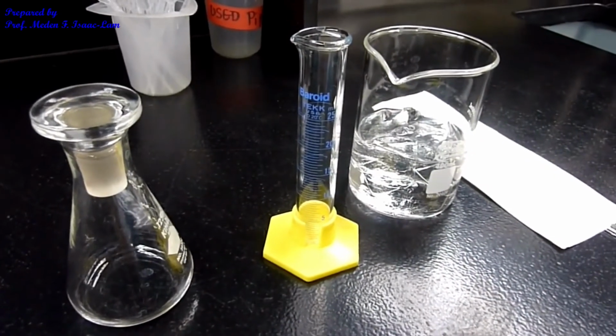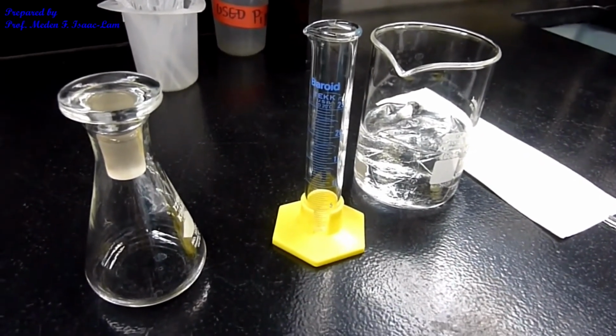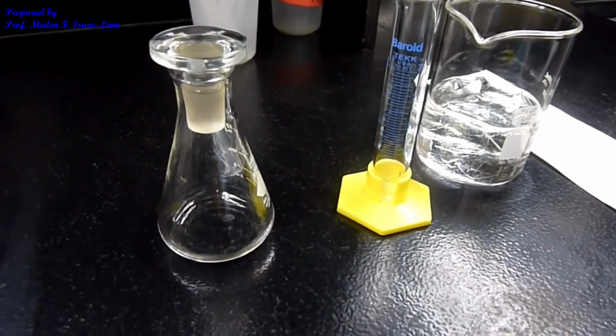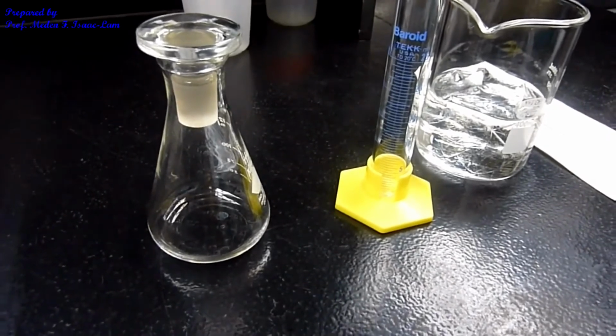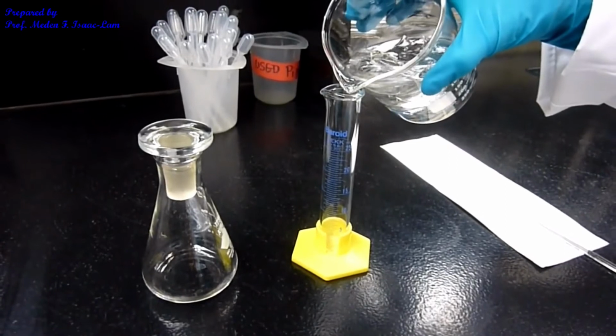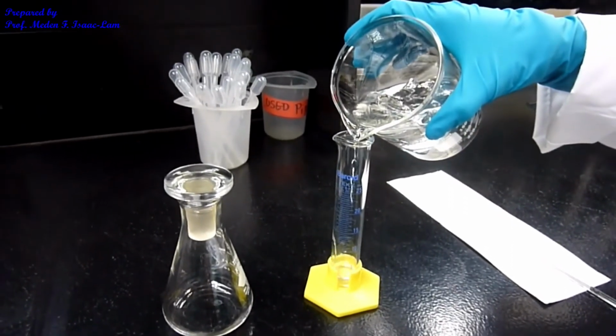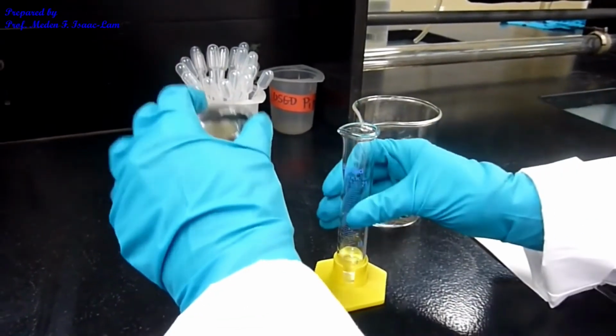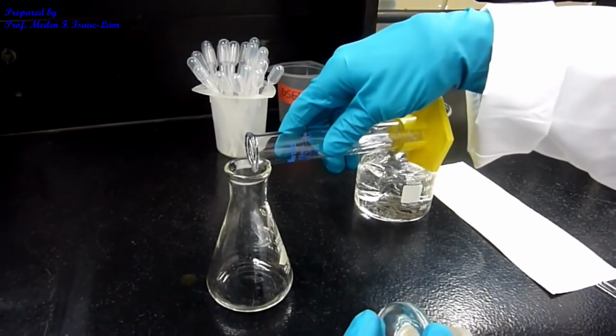So the next step is to isolate the product aspirin from the reaction mixture after we tested that it's already completed. And then I will now have ice water in here. I'm going to measure about 5 ml of the ice water to precipitate out the aspirin. So I'm going to add it in the reaction mixture.